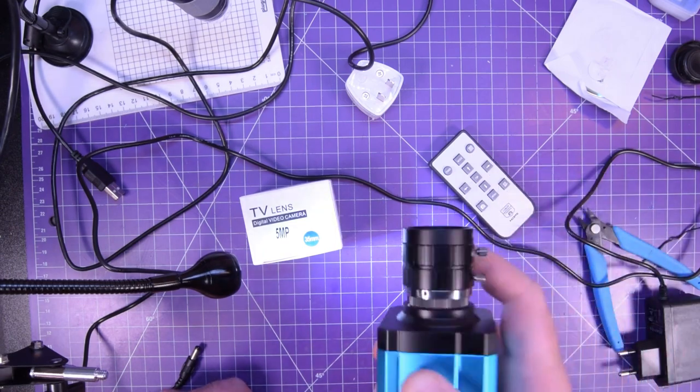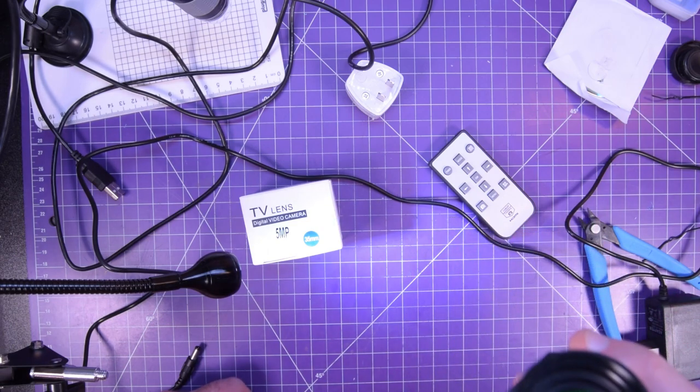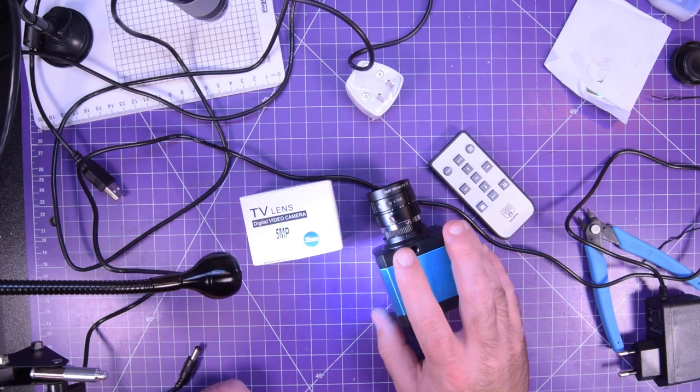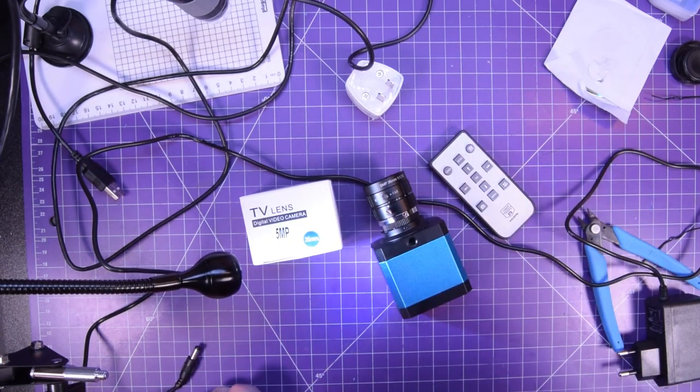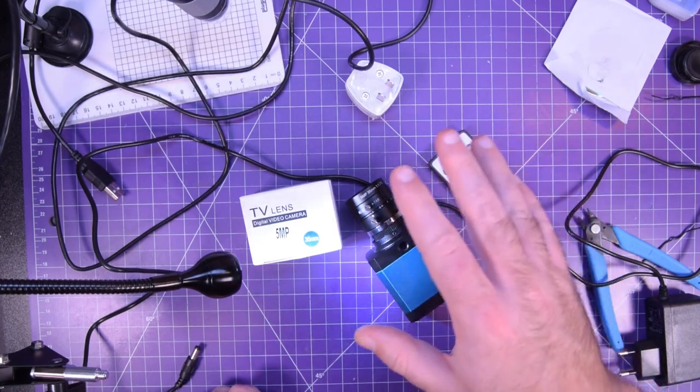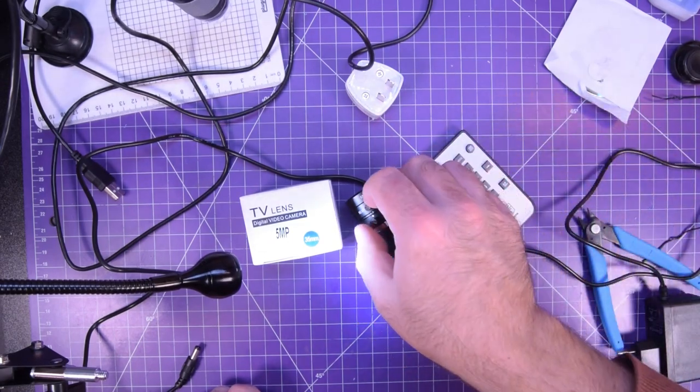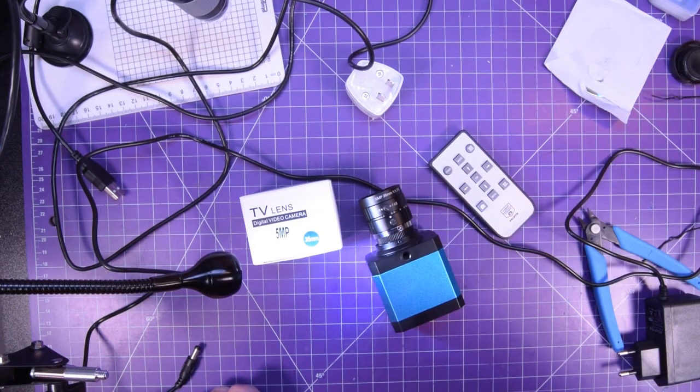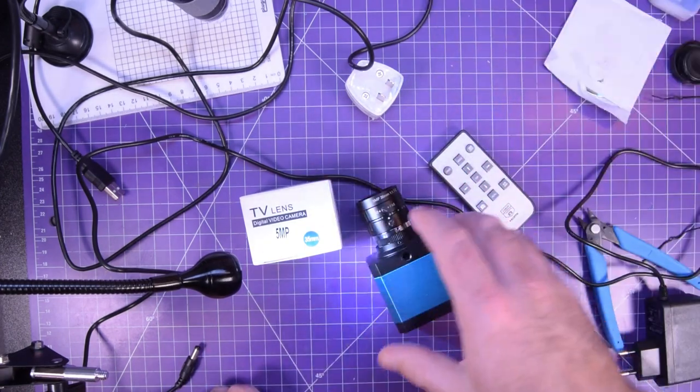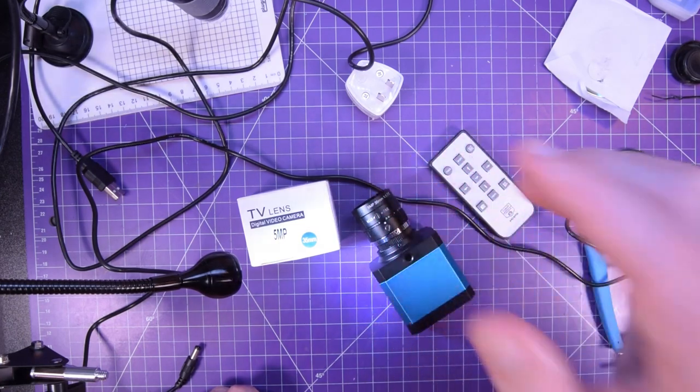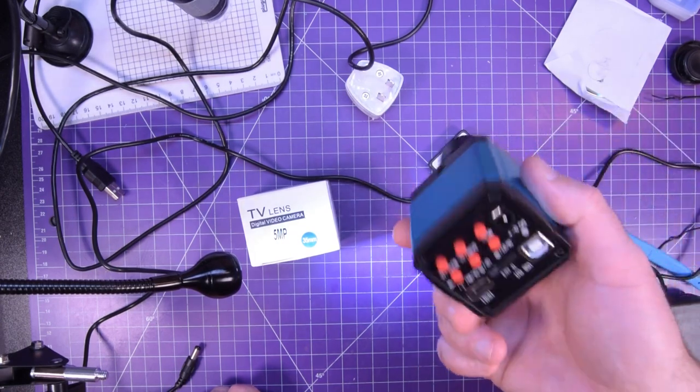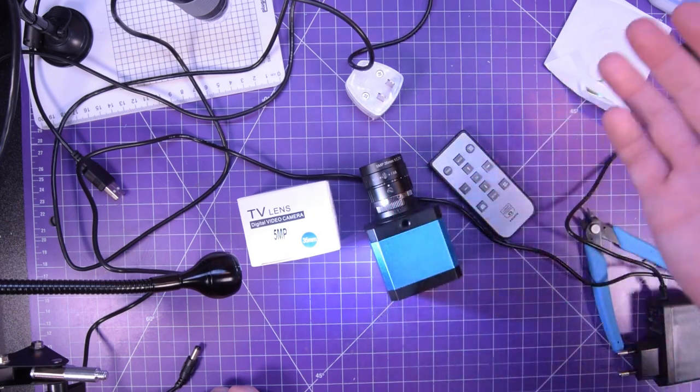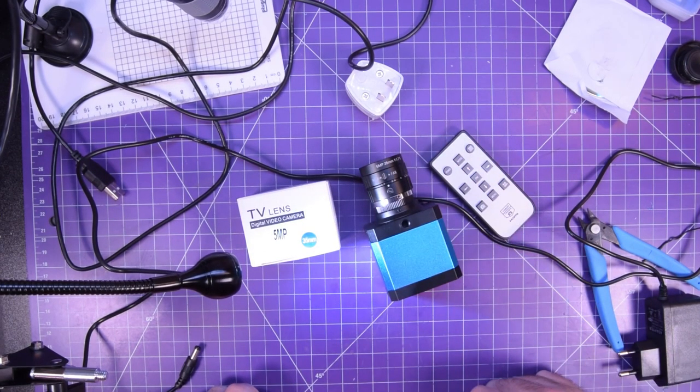The only thing if you're going to be plugging in a lot of webcams into your computer is that the webcams have to be on a different controller, like USB controller. So if I want the webcam here and this thing also plugged into my computer, they can't be in the same hub in the same port. They have to be on separate ports controlled by separate devices. So basically, you know, if you have front panel USB, rear panel USB, you can plug one in each. And then if you have more devices to plug in, you may need a PCIe card with USB ports on that. This thing just uses USB 2.0, not 3, which is good.